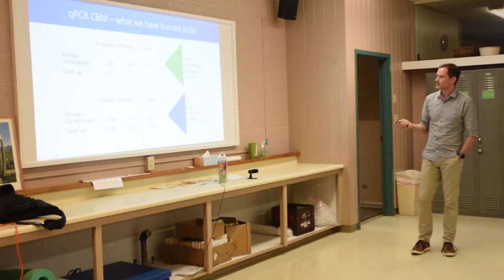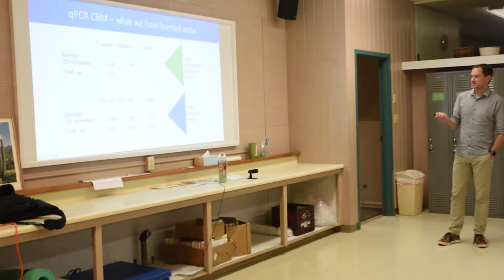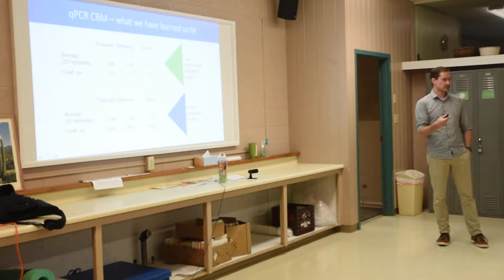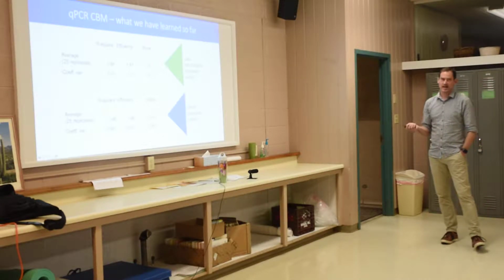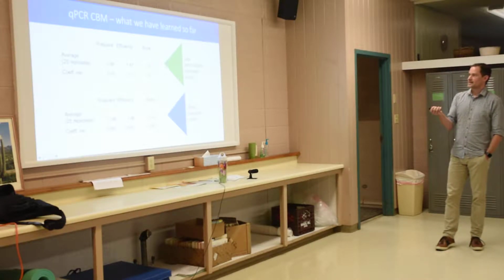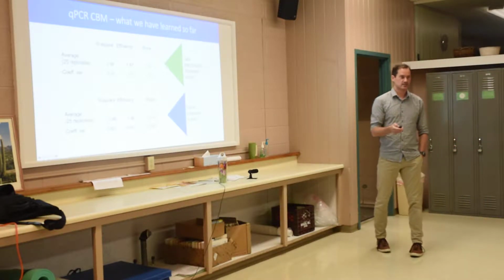Okay? We also know that our participants who do the CBM programs are really good at doing qPCR. I think you probably actually care more about it than the people who do it routinely in the labs. You actually pay more attention to what's going on. But over 25 replicates, if we do a blinded study where we just give a bunch of samples to a community partner and we get them to run qPCR, they have very good R-squared values, very good efficiencies, and everything matches very closely with a trained lab person.